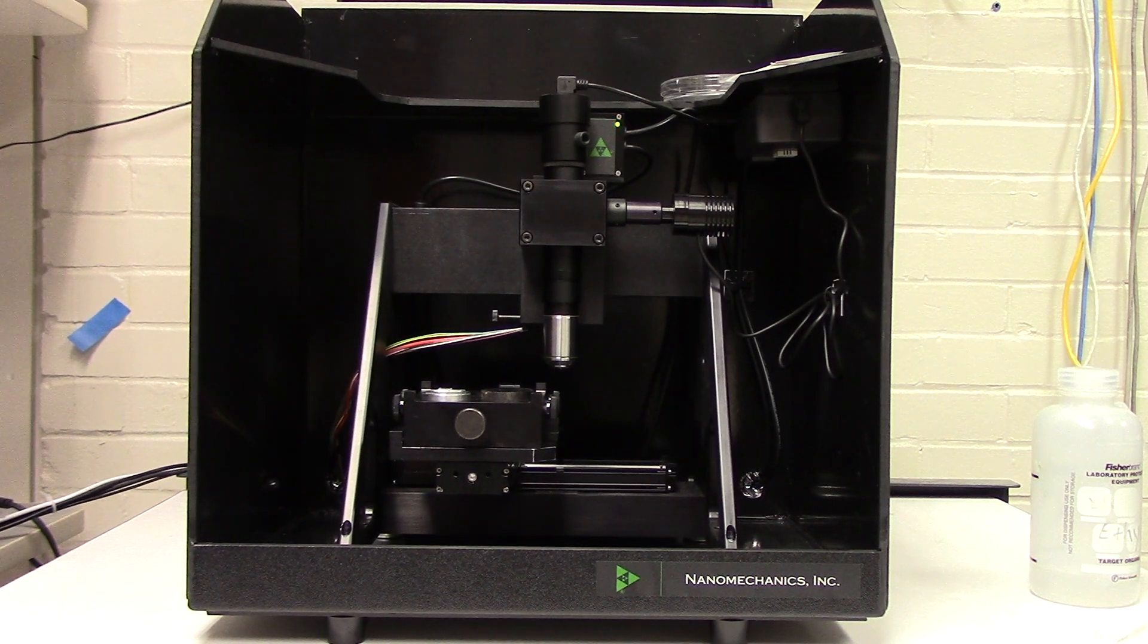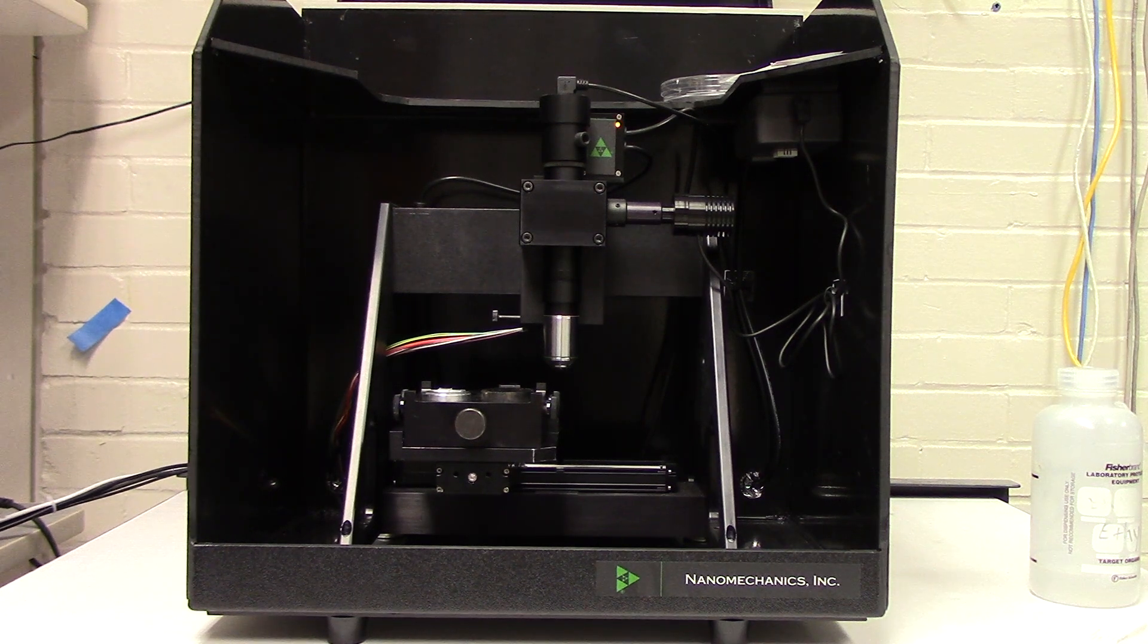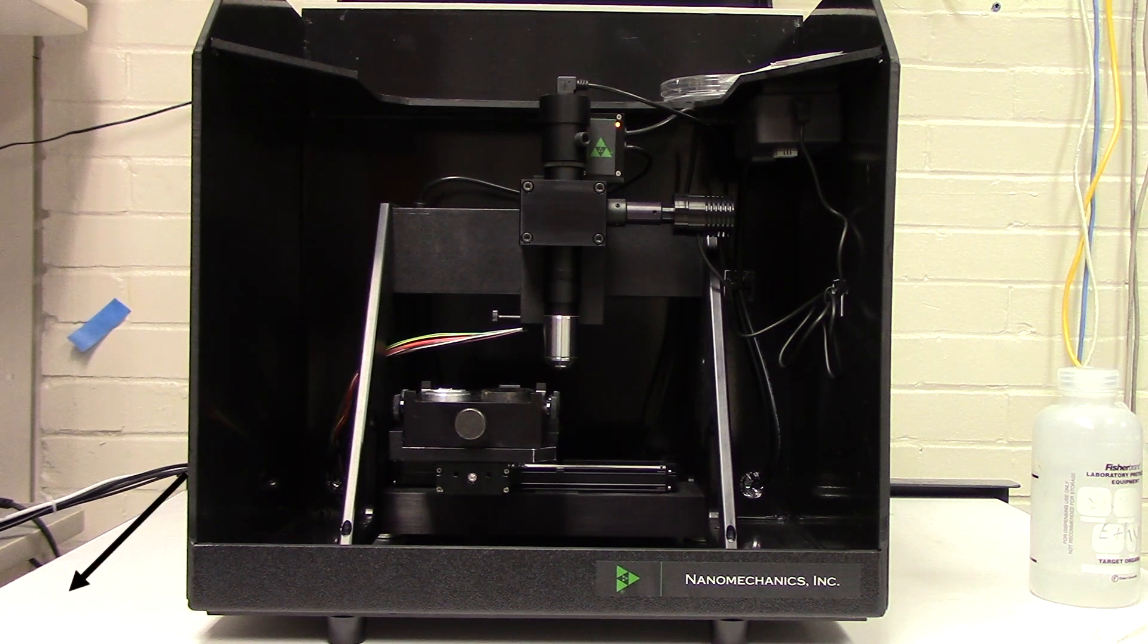Here we have the inside chamber of the Nano Indenter. To further stabilize the system, this chamber sits on top of an optical table to minimize vibrations in the machine.